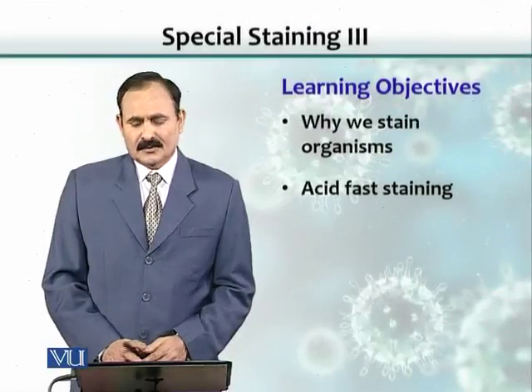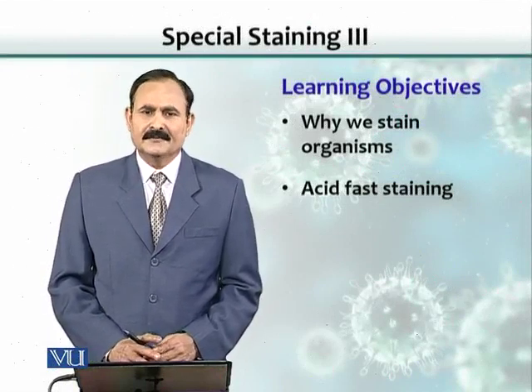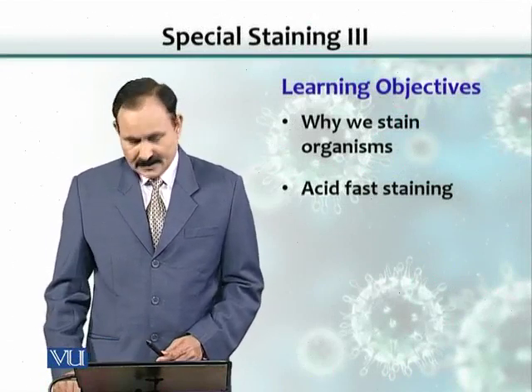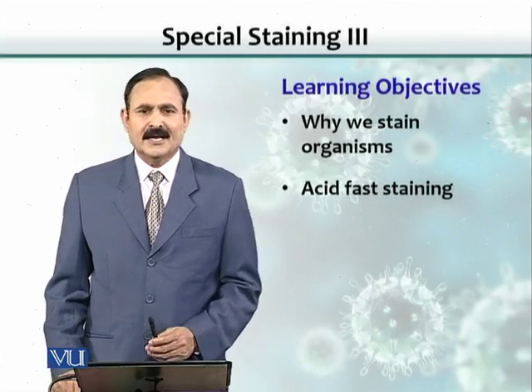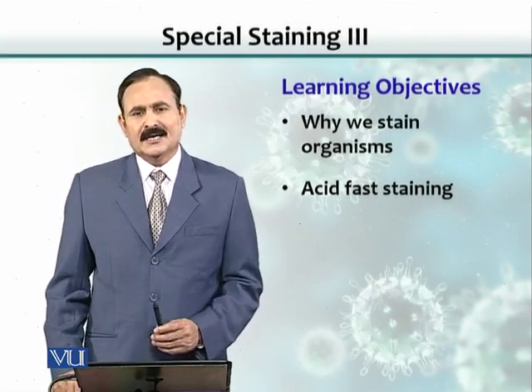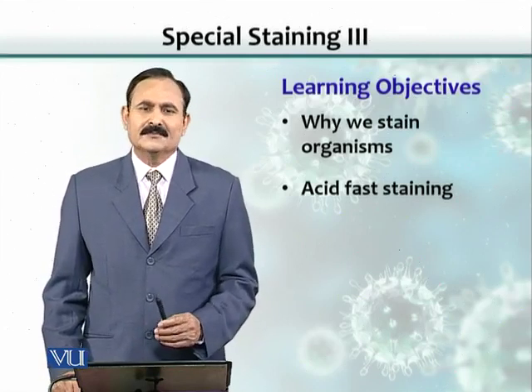Learning objectives include why we stain microorganisms and what is acid-fast staining. As I mentioned earlier, stain or staining procedure enhances colors, and human eyes appreciate colors, and that is the reason we can see organisms more clearly.